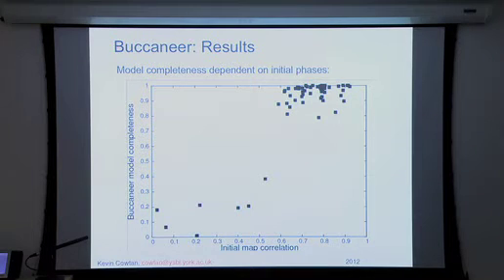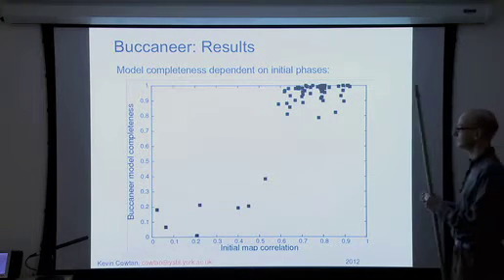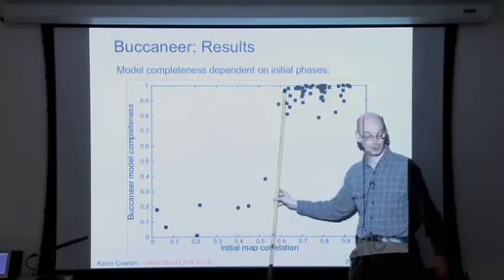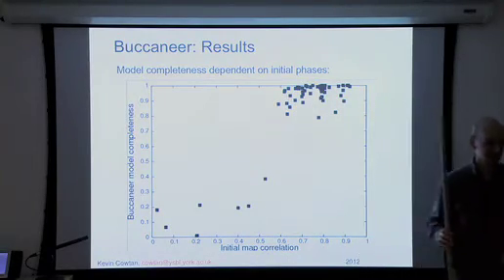Is there a jump there, or is it just the absence of the? It is a jump, yes. And this is something that the Phoenix and ArpWarp people have found as well. Map correlation between 0.5 and 0.6 is the point where it fails, although ArpWarp can bootstrap from poor phases if the resolution is very good.